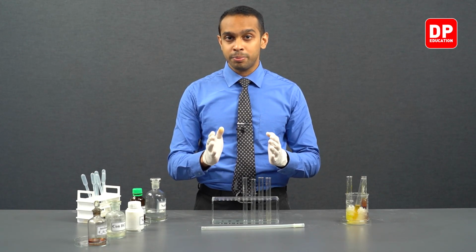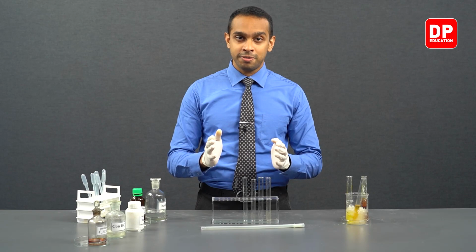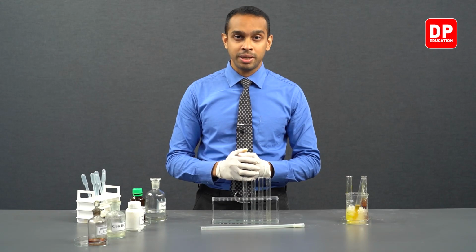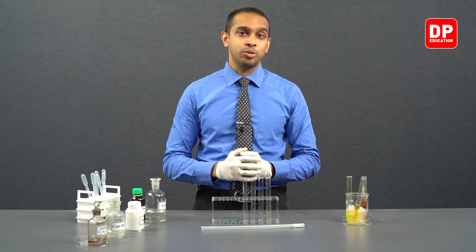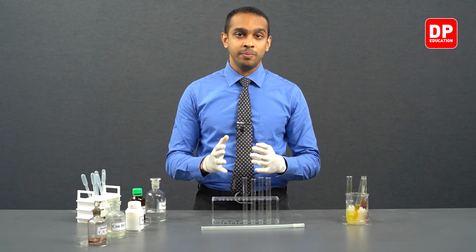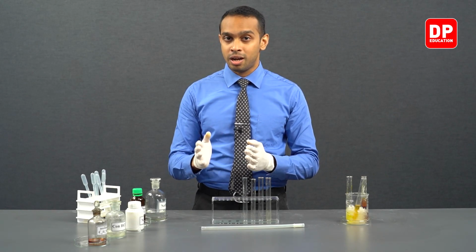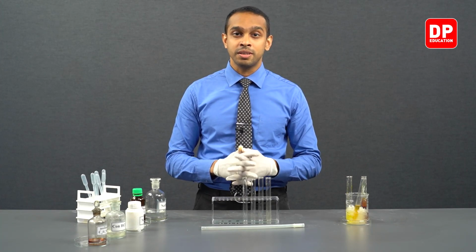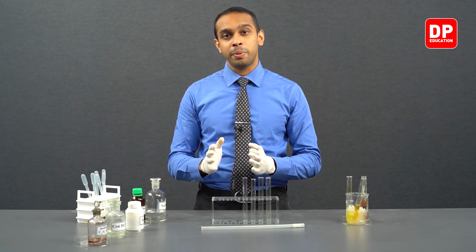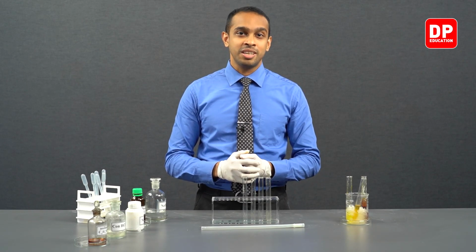And while maintaining lower temperatures to this benzene diazonium chloride, we added alkaline phenol or phenol in an alkaline medium. When we added phenol in alkaline medium into our benzene diazonium ion solution, it formed an orange-red color precipitate, which was our azo dye. So this is how we identified the presence of aniline. Now, let's move on to other theory parts revolving around this practical and some questions that is revolving around this aniline practical.